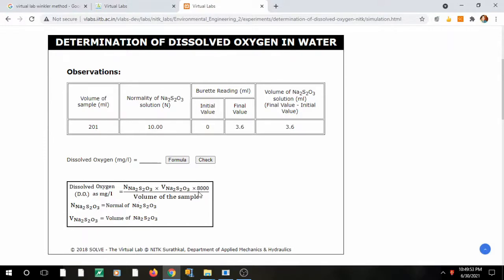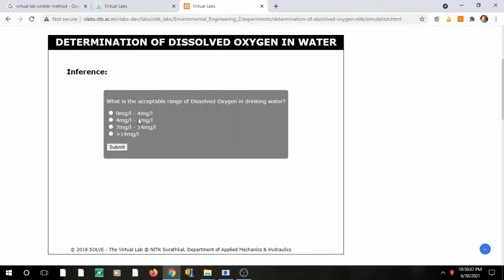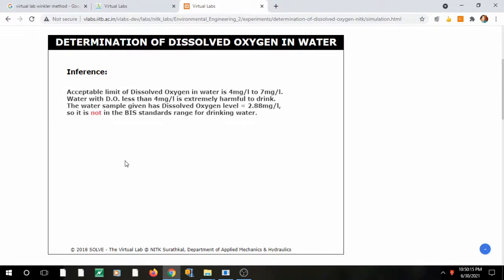Add starch using a dropper — the color turns blue. Then titrate again with sodium thiosulfate until colorless. Note the final burette reading: 3.6. Record observations in the observation table. Using the formula N₁V₁ = N₂V₂, multiplied by the equivalent weight of oxygen (8) and by 1000, the result is 2.88 mg/L. The acceptable range of dissolved oxygen is 4–7 mg/L; water with less than 4 mg/L is extremely harmful to drink. Since the sample gives 2.88, it is not within the BIS standard range for drinking water.